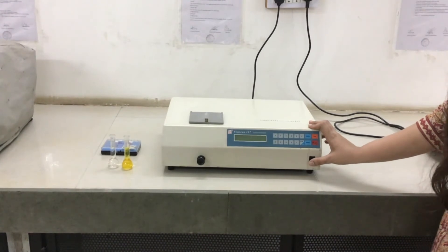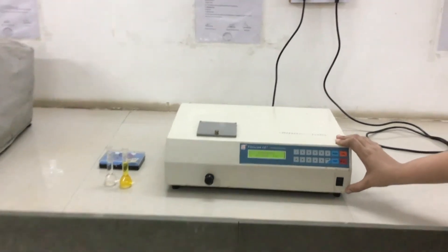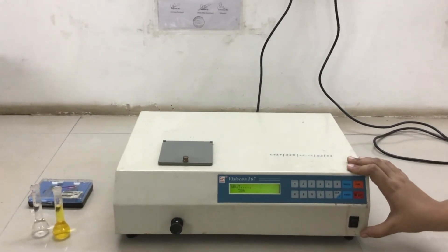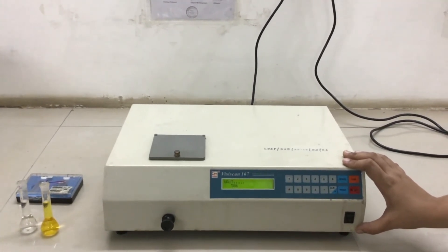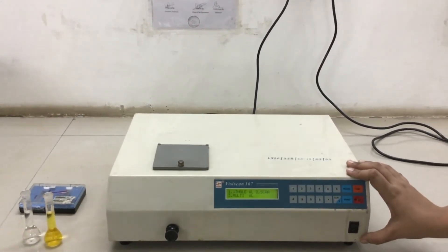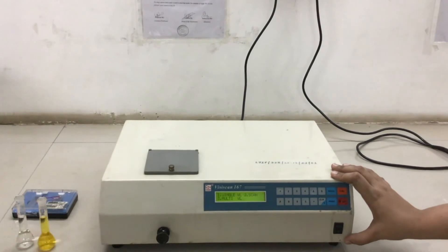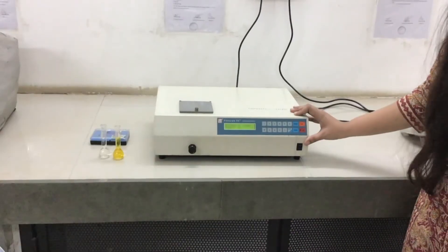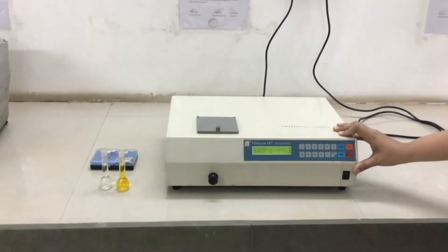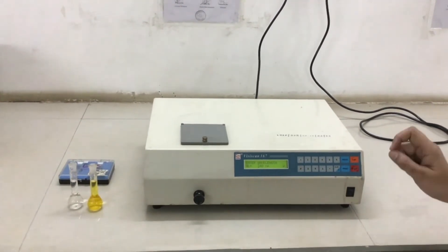Switch on the instrument to begin initialization. During initialization there are three modes: single wavelength, scanning range, and multiple wavelength. Today we will use single wavelength mode for analyzing the sample. Press 1 to select it, then enter the particular wavelength for the sample.